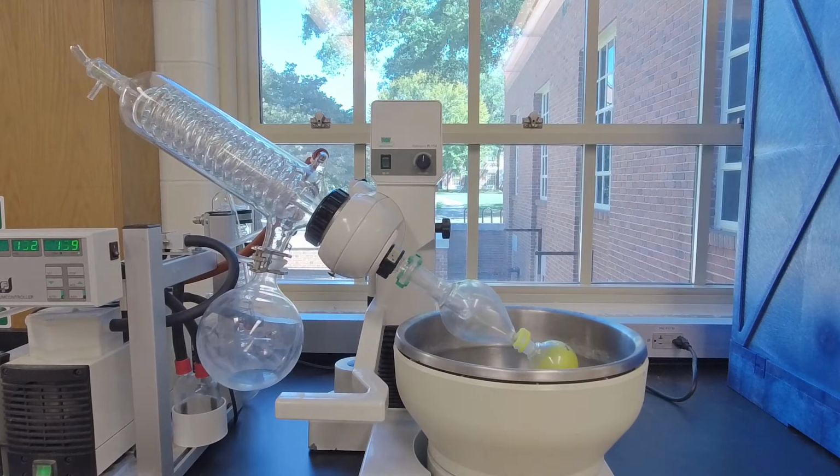It's certainly, you'll feel that suction, but it's not super high. We have vacuum pumps, basically just a little motor that you hook the exhaust up to the flask, where we can evacuate that flask down to a millitorr, and then that will sort of pull off the last remaining vestige of solvent. Okay, I'm going to call this good.